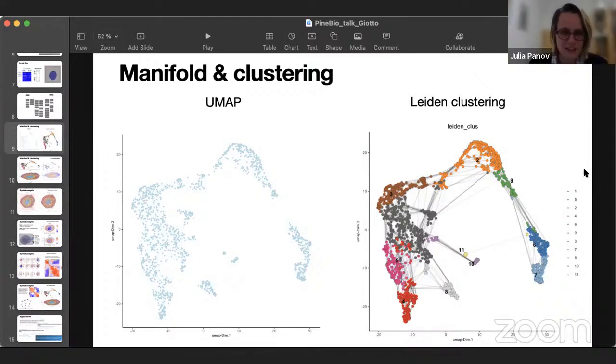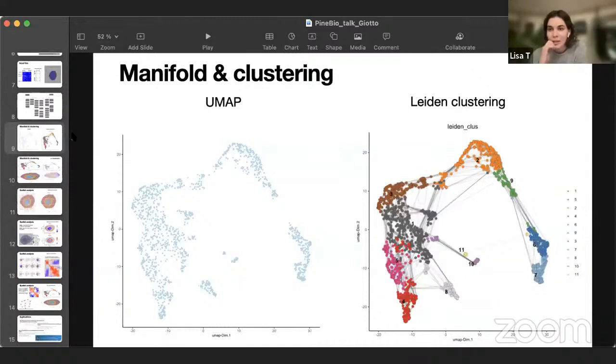Also, if I could add to that, if you are using Visium, then as Lisa has mentioned, you are not actually capturing each individual cell. You are capturing a small well that has a few cells in it, right, Lisa? So probably, at least for now, the resolution of the single cell RNA-seq is probably better than at least this Visium.